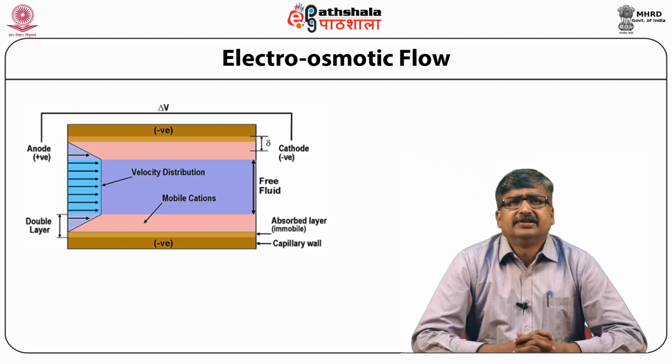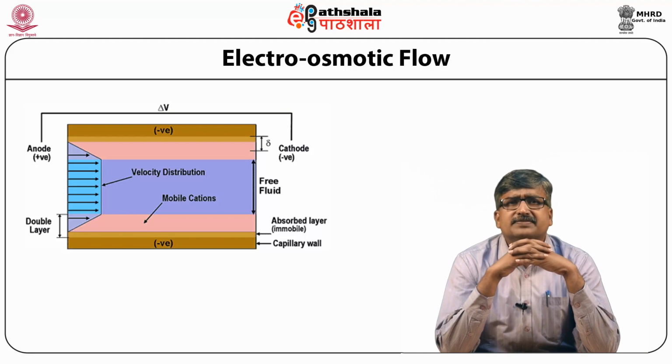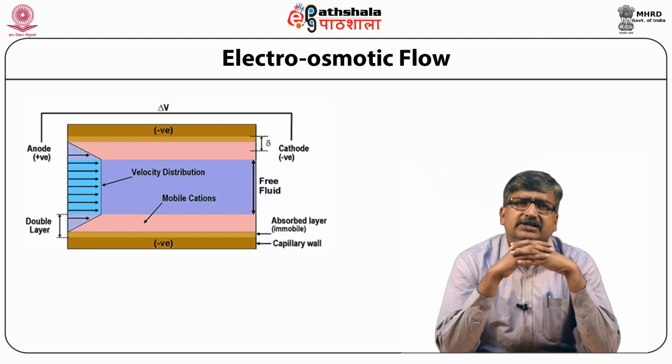This can have the effect of altering the required capillary length but does not affect selectivity. The basic instrument setup of CE is shown in the figure. A capillary is filled with electrolyte and both ends are immersed in buffer reservoirs. A high voltage power supply applies the electrophoretic field with the electrodes between two buffer reservoirs.